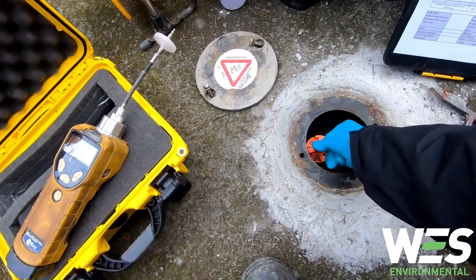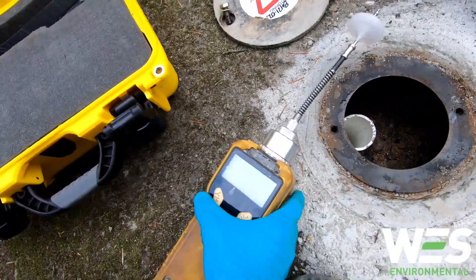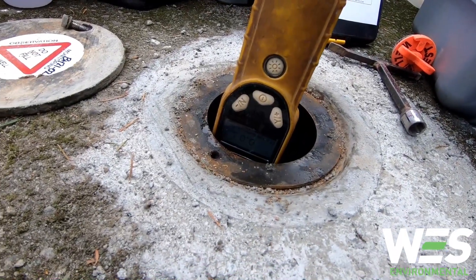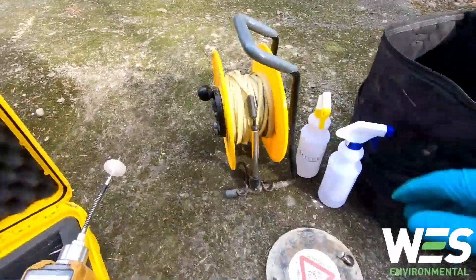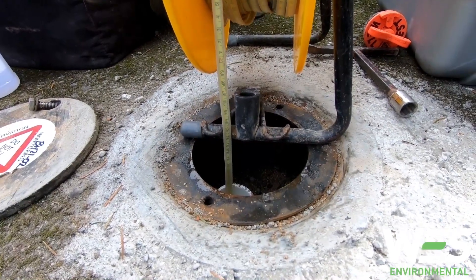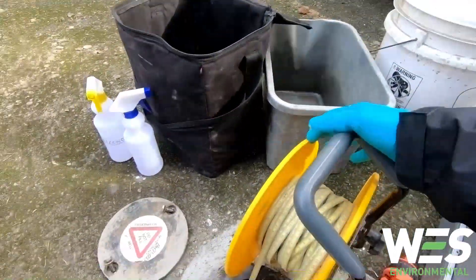Right now I'm going to check for VOCs in the well. So I'm gonna toss that all the way down and see if the meter goes up or not. Next thing is I'm going to check the water level — keep letting it go down. So it's at about 1.9 meters below ground surface.